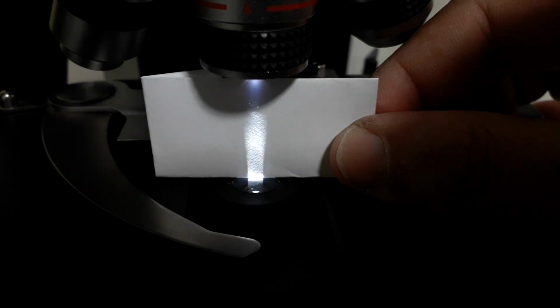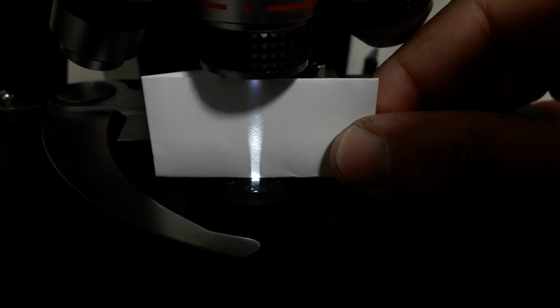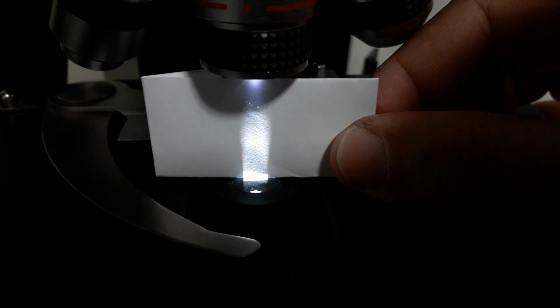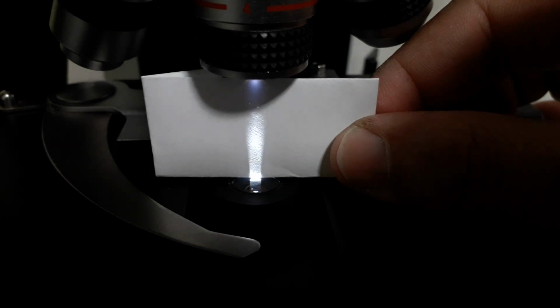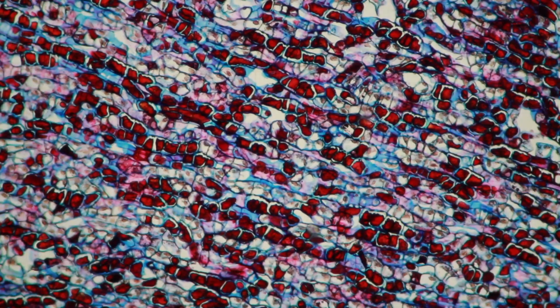As a consequence of this, you are able to limit the light only to the part of the specimen that actually needs to be illuminated, and this significantly reduces stray light, and it also ensures a very uniform illumination, which is especially important when doing photographic work.